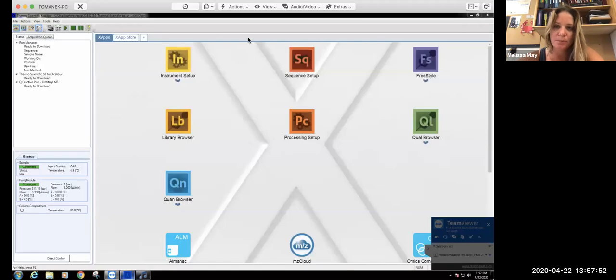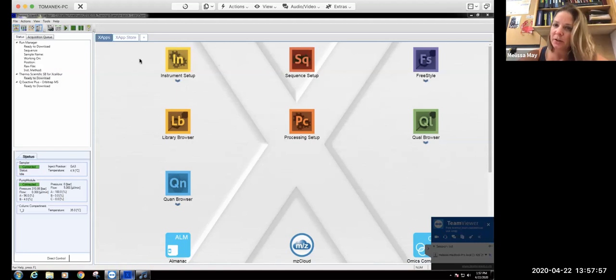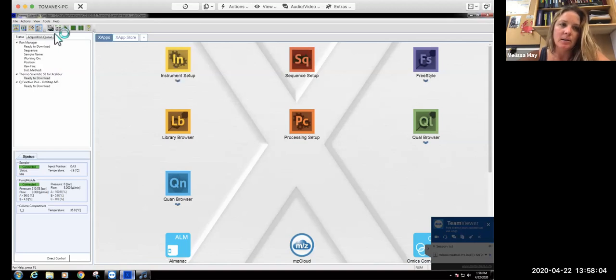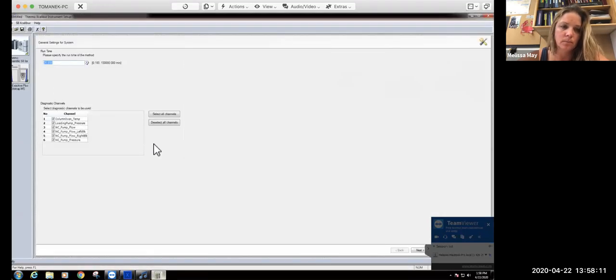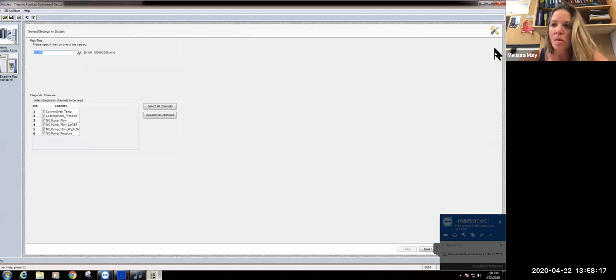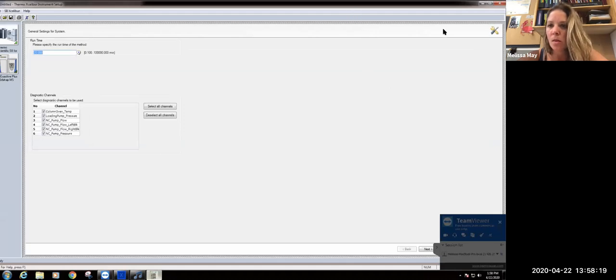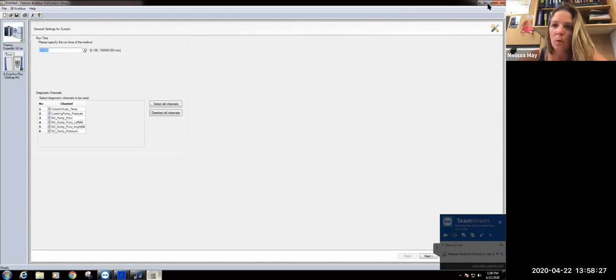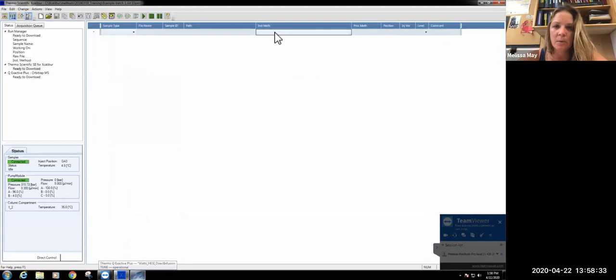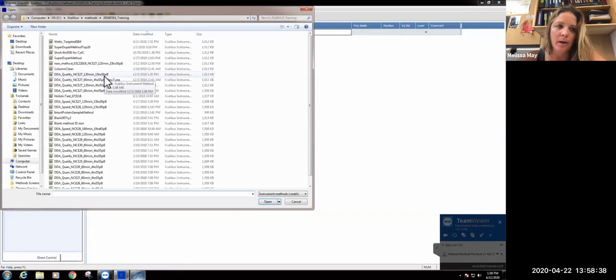If we go over to TeamViewer and we want to look at our particular method, there's a couple of ways we could do this. You can open up that particular method using this open button. Or alternatively, we could go into our sequence setup, go to instrument method, and go to browse. This allows us to load any method that we want to use.